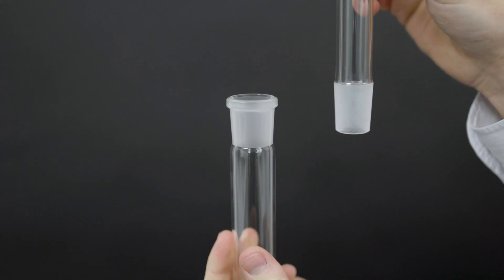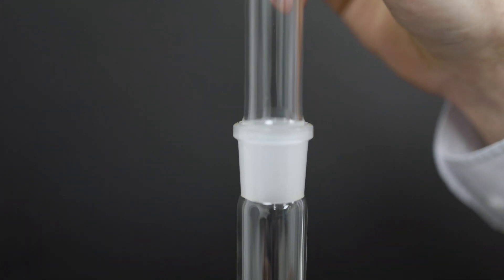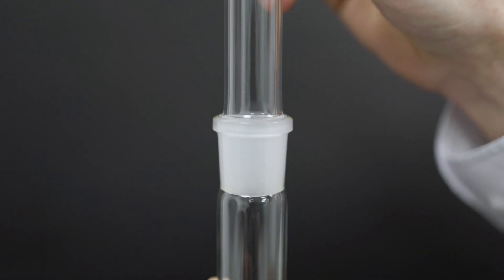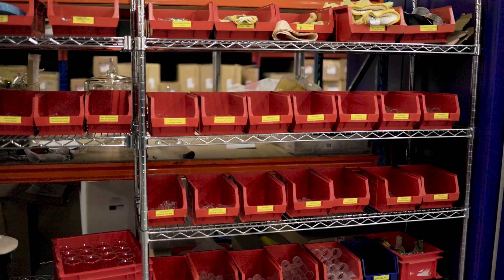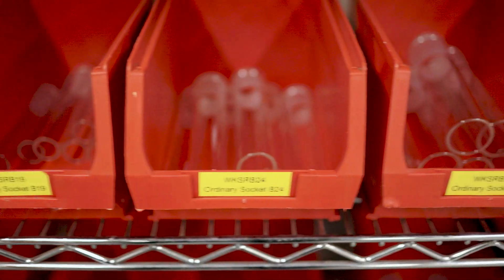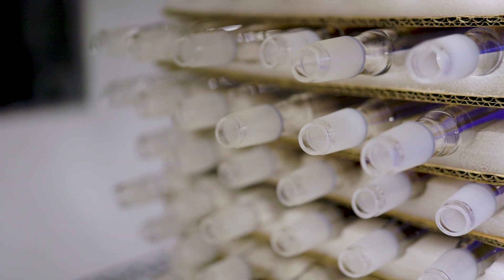Conical taper joints are a very common way to connect lab glass components. They're called male and female joints and permit quick leak-tight fittings. They're manufactured by forming glass tubing into a conical taper very near the final dimension, then grinding the conical surface down to a standard size. They're near universally 1 to 10 taper.